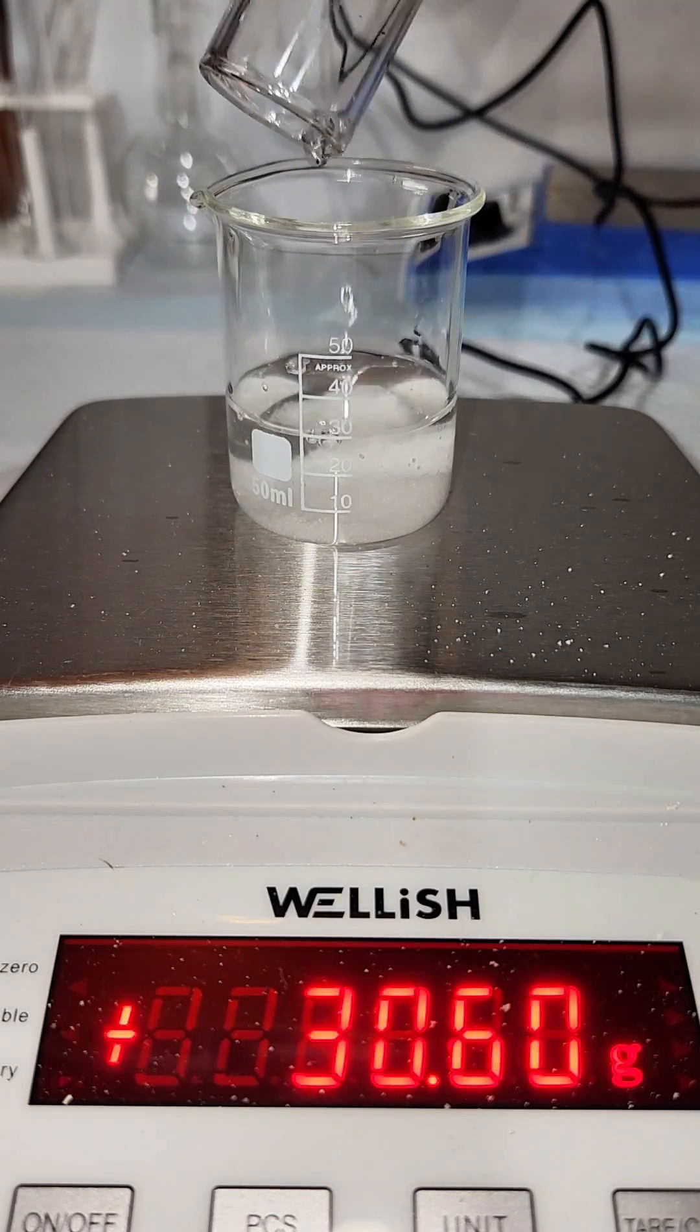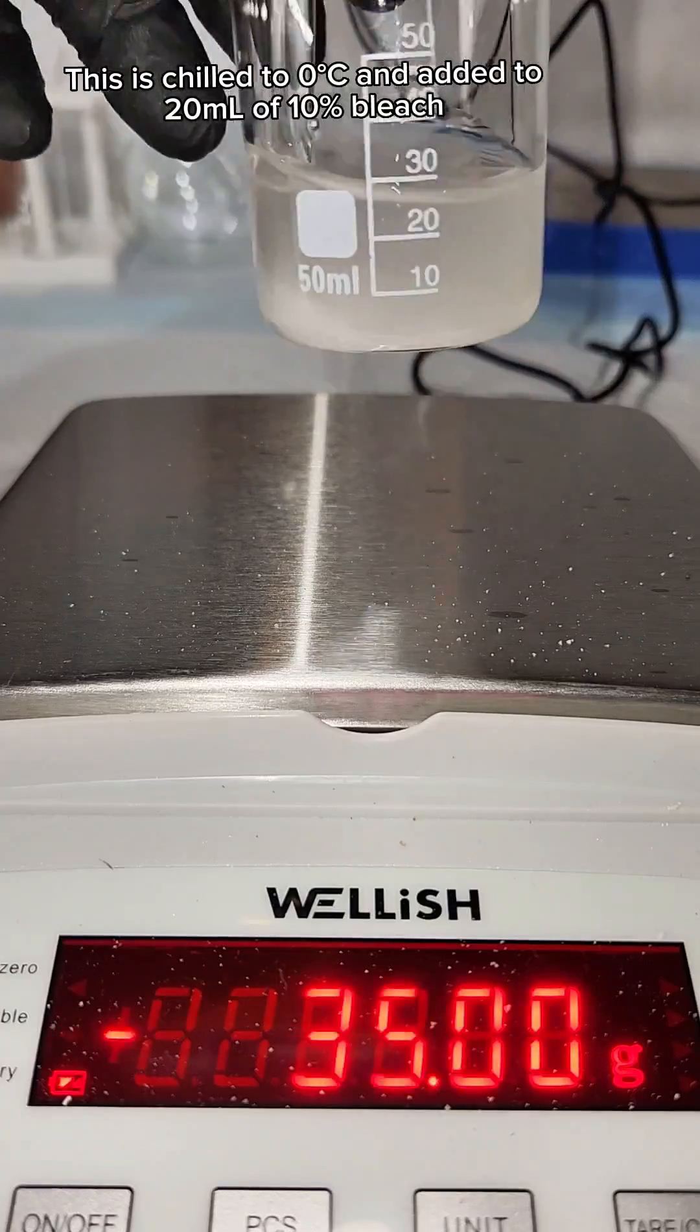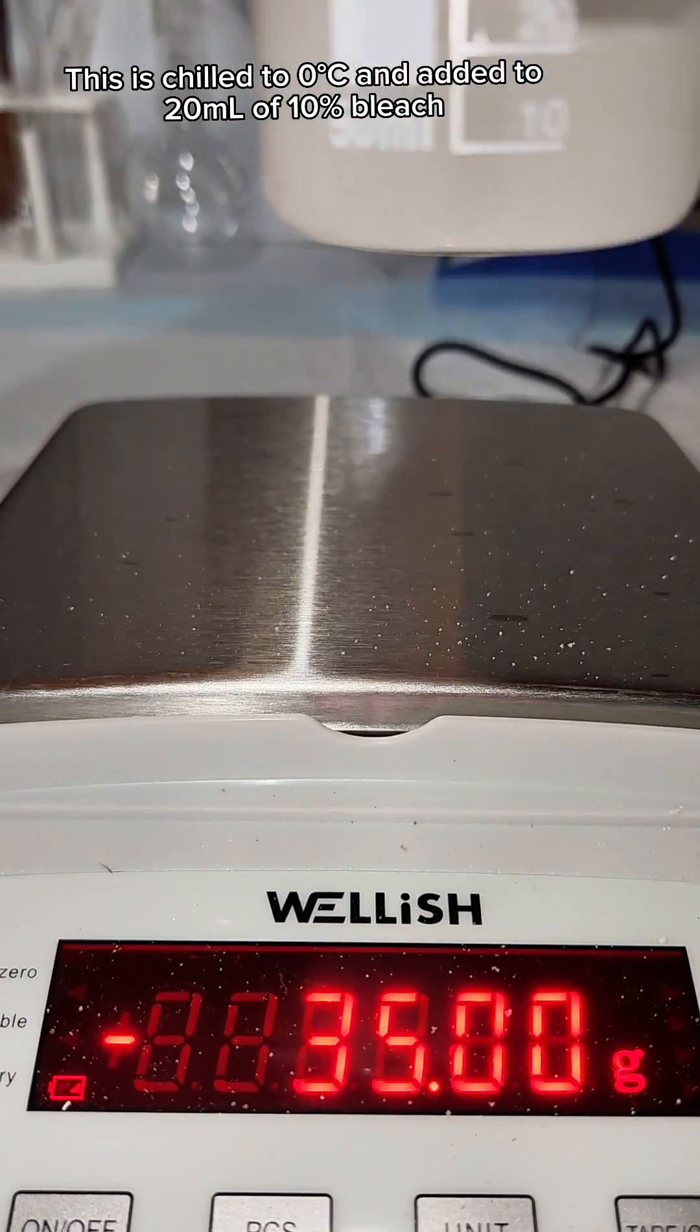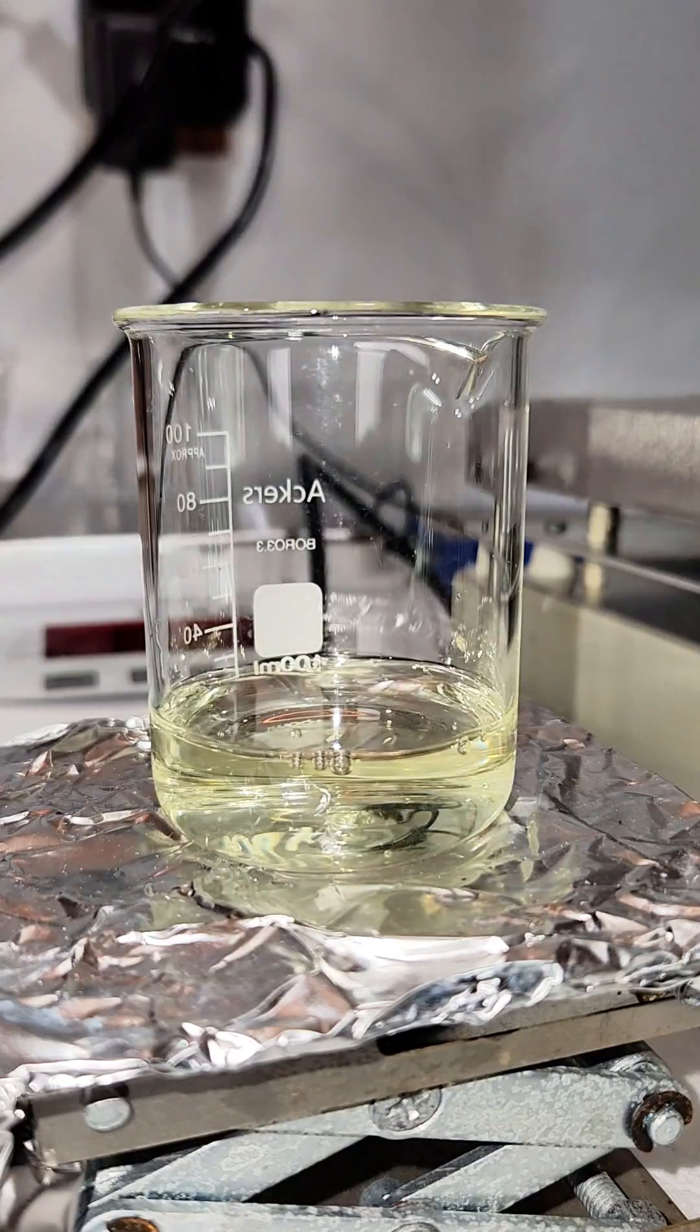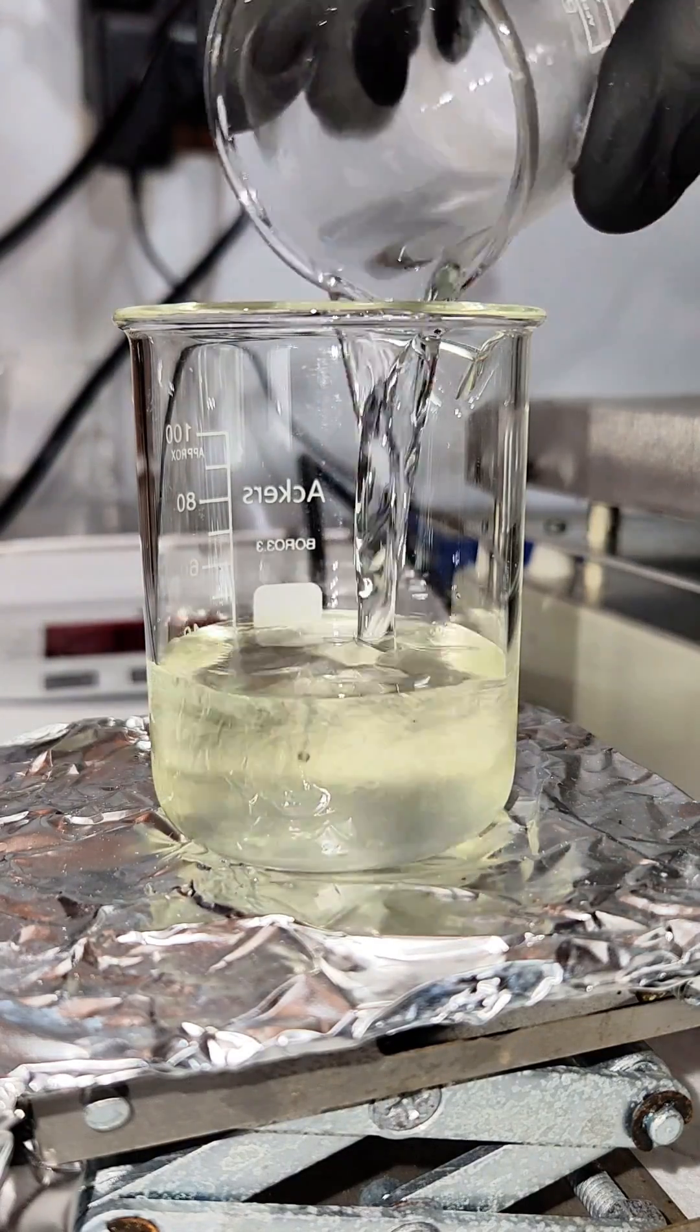The first thing I want to do is dissolve 6 grams of sodium hydroxide in 25 milliliters of distilled water. I then chill this to 0 degrees Celsius and add it to 20 milliliters of 10% sodium hypochlorite bleach solution.